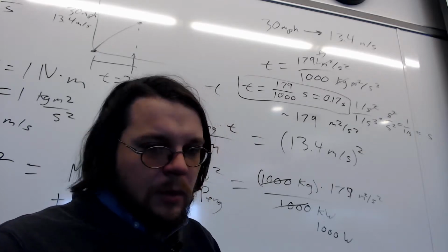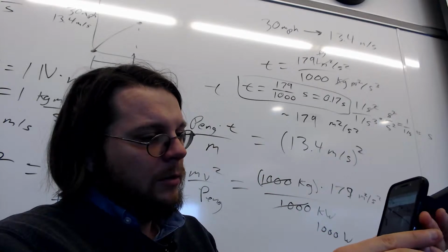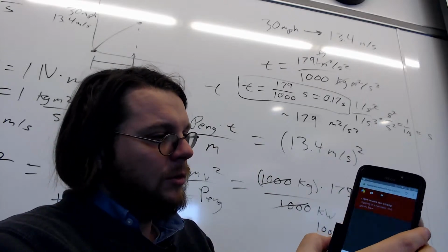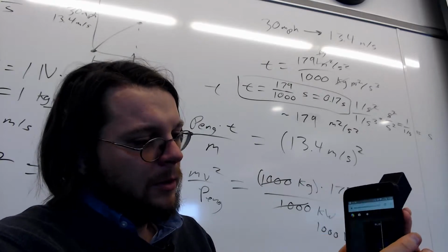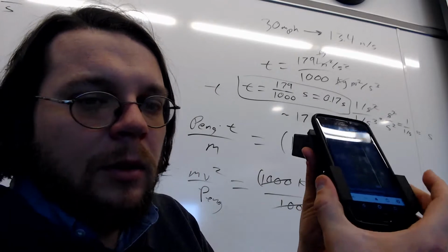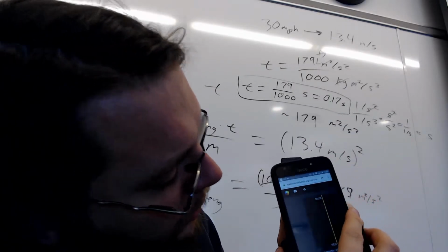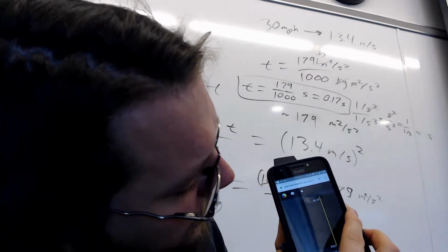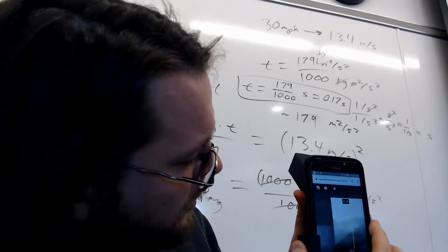So all right, here we go like this. I'm going to rotate it back like that. And so now I'm going to make sure that the little hole here aligns with the hole in the camera. And let's see. I'm going to point it towards the wall here until I see. So I'm moving this thing back here to try to make sure it's in the right spot, which can be tricky.